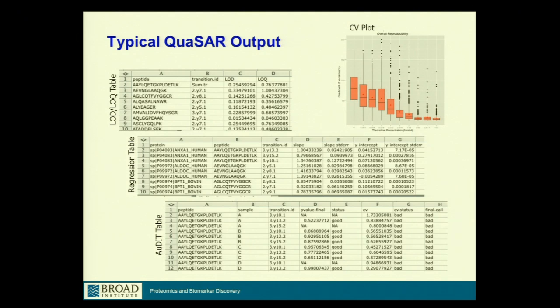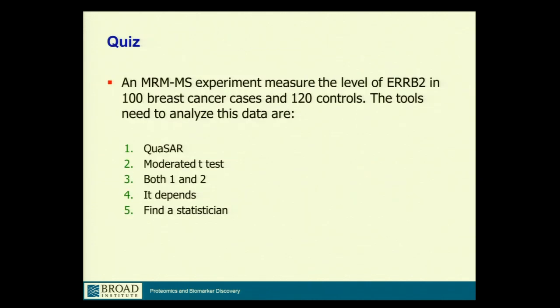And then the CV plot. As concentration increases, you can see that the coefficient of variation actually drops quite well. So this is an ideal situation which you would expect. At very low concentration, it's hard to measure, and so you have a lot of variation. As you go higher and higher, you can measure better and better, and your CV drops. So audit will create plots like these if you have replicates for the samples and concentration curves that you have.